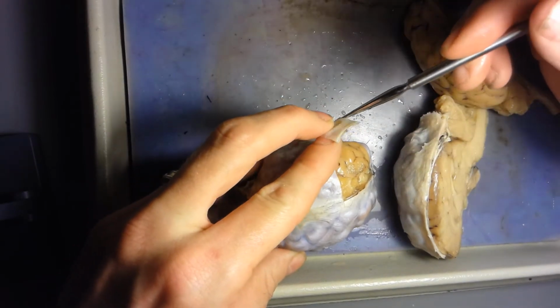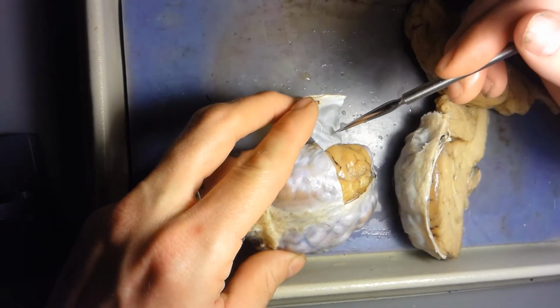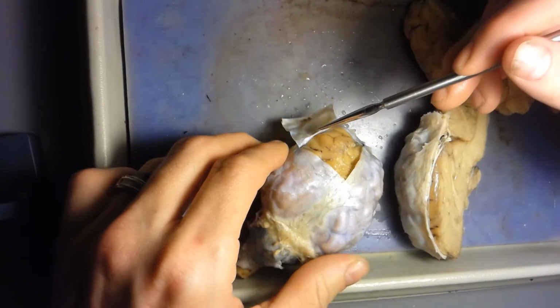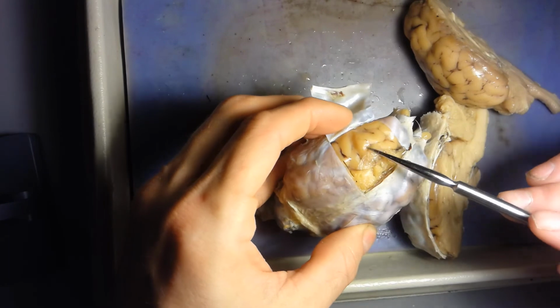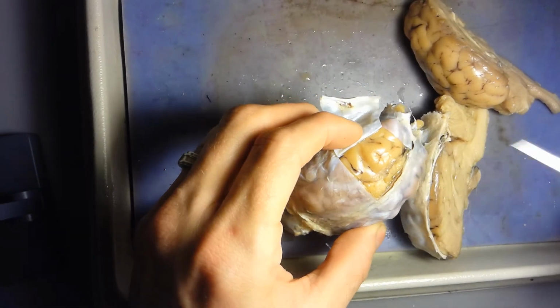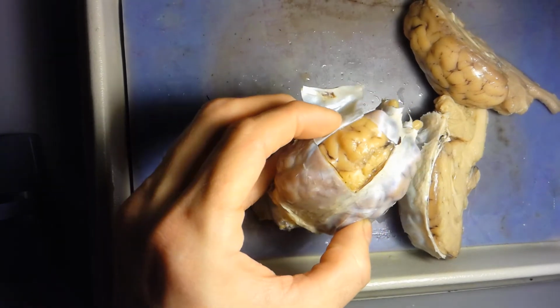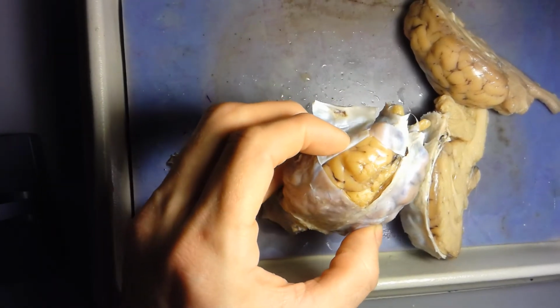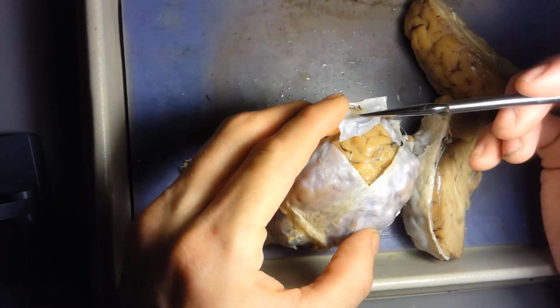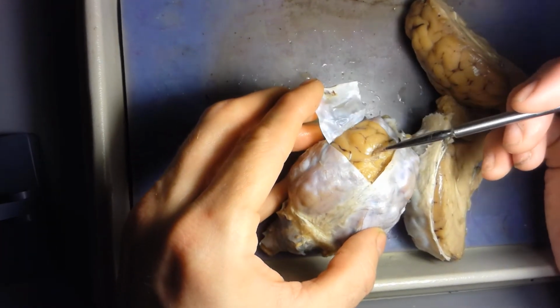So dura on the outside, arachnoid on the inside there. Now the last one, the pia mater, is right on the surface of the brain, and it's really hard to take it off, but if you see a little bit of a shininess to the brain, that's the pia mater. That's right on the brain tissue itself there. So those are the 3 meninges: dura, arachnoid, and pia.